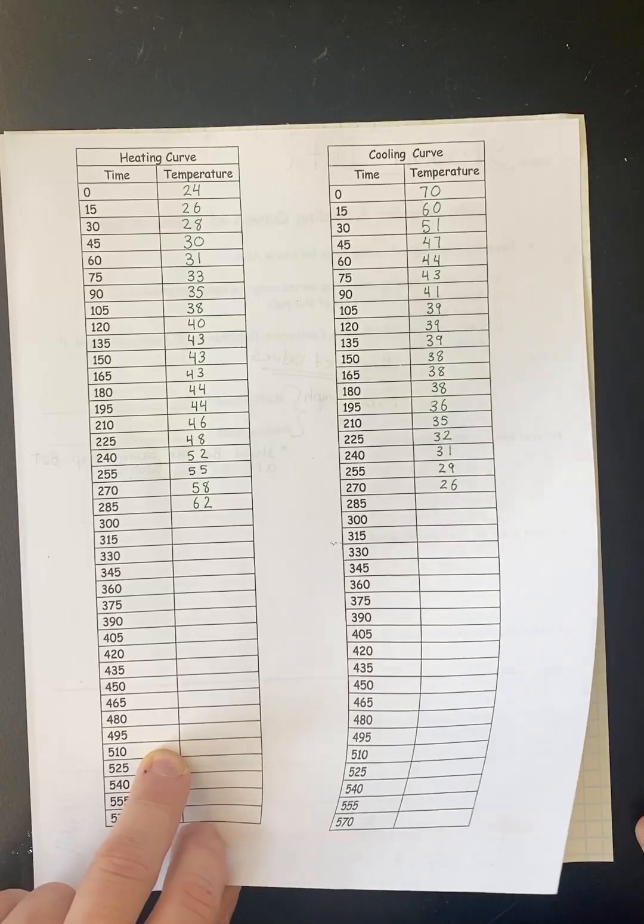But basically what we're going to do is we're going to graph the data and we're going to get a heating cooling curve. So you're going to need a sheet of graph paper. We're going to turn it sideways.